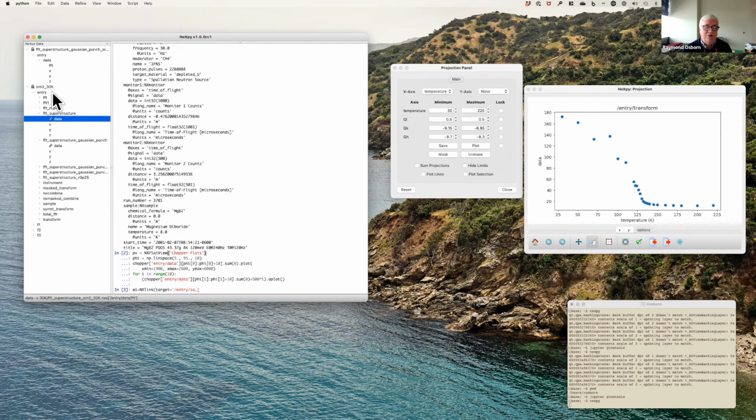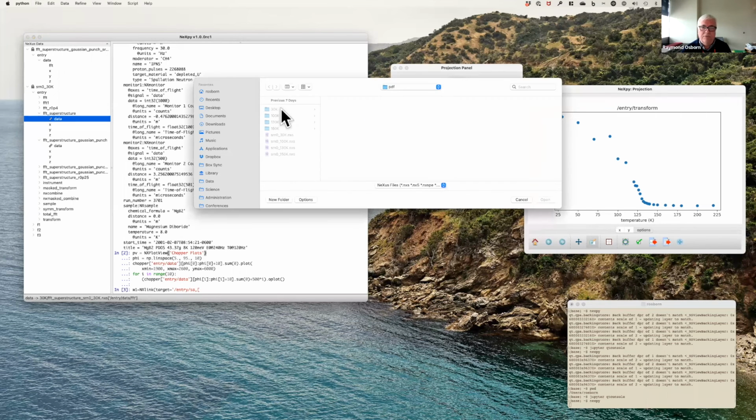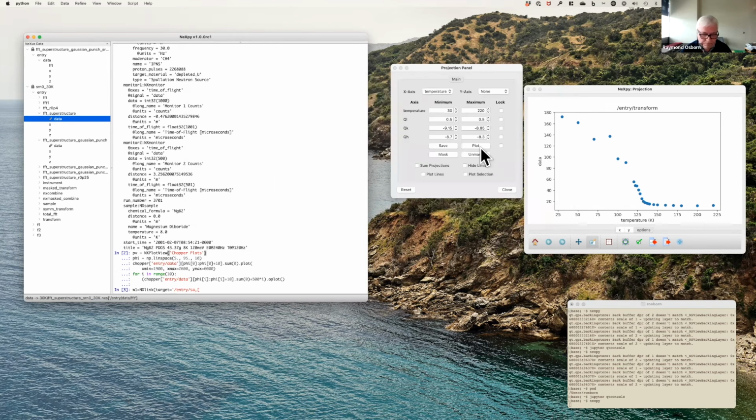And now what I've actually done in this case is, this is a subset of a massive amount of other data which are left behind on our server, just because I only wanted to plot this file, so I only had to copy that over, and that still works. Okay. Yeah. Cool. Thanks.